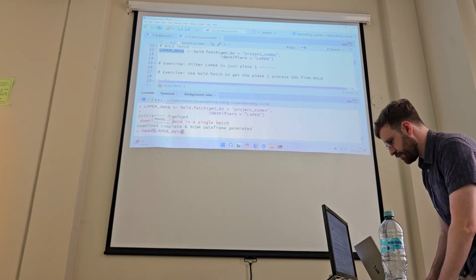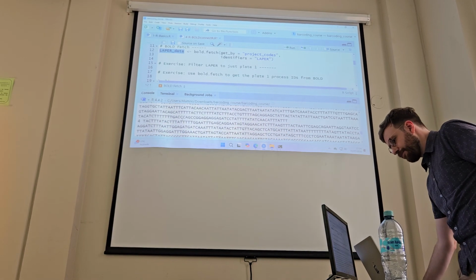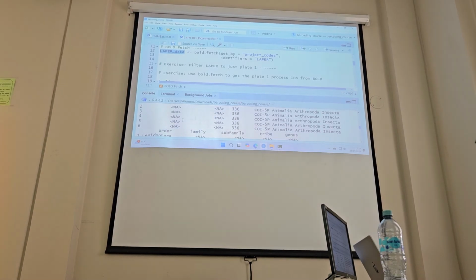I'll see why it didn't work for some of you. You should see here all the data. Bit of a mess. So it didn't work for you?